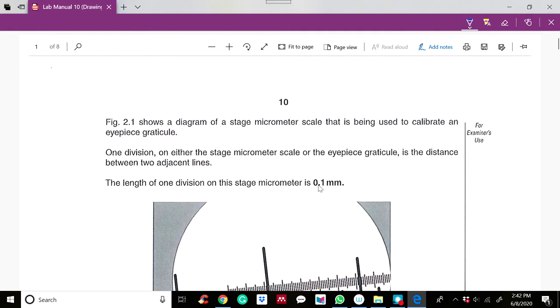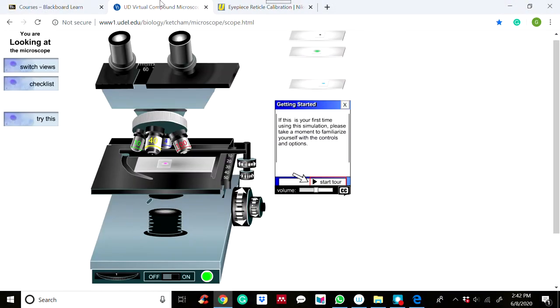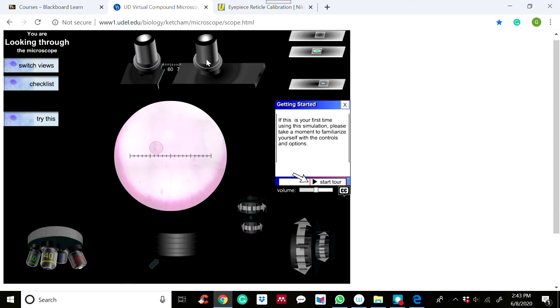An eyepiece graticule is a scale that you can find in the microscope — it is actually embedded in the eyepiece ocular of the microscope. As you can see in this visual, the eyepiece graticule is embedded inside so you can see it together with the image of your specimen.